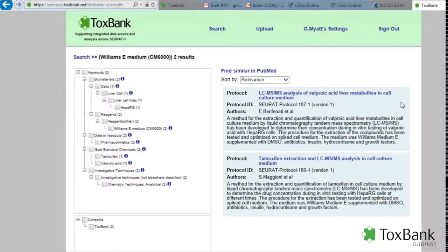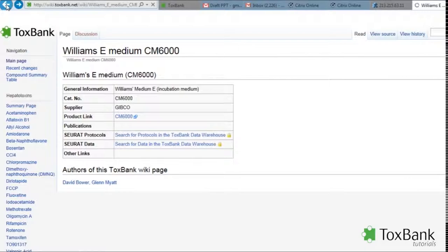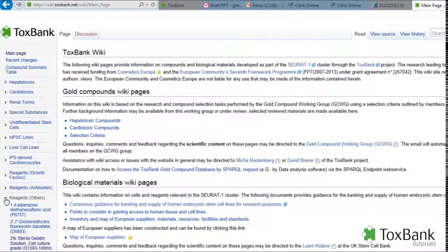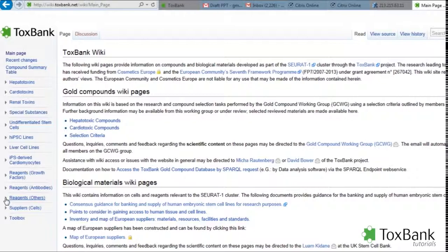So in summary, the Toxbank wiki contains information on reagents, both growth factors, antibodies, and other reagents. It provides links to suppliers. It will provide links to key publications and general information about the reagent, as well as direct links into the warehouse where there may be data or protocols available for those reagents.